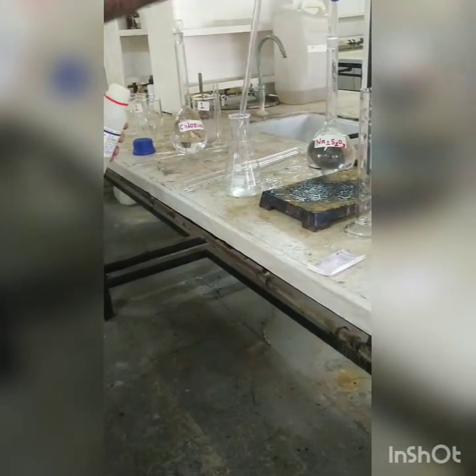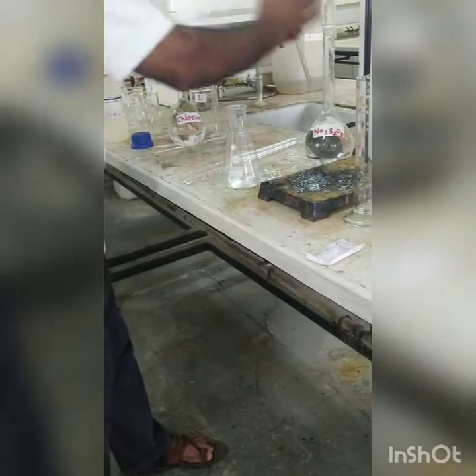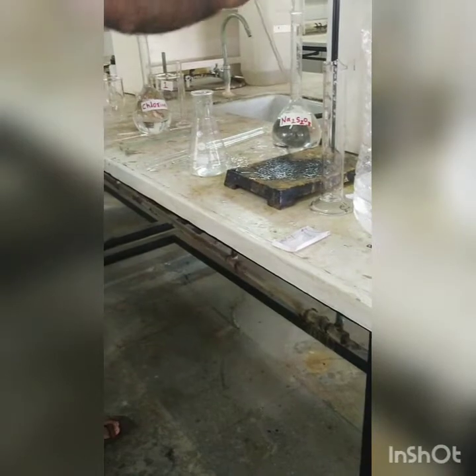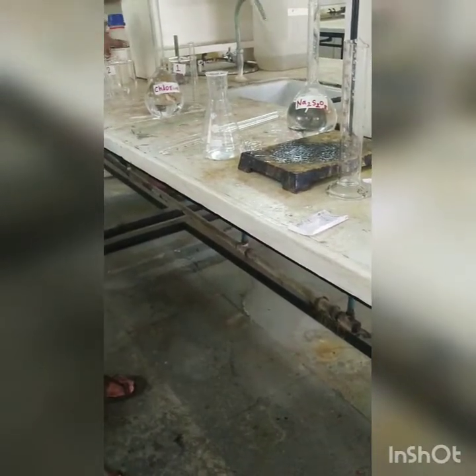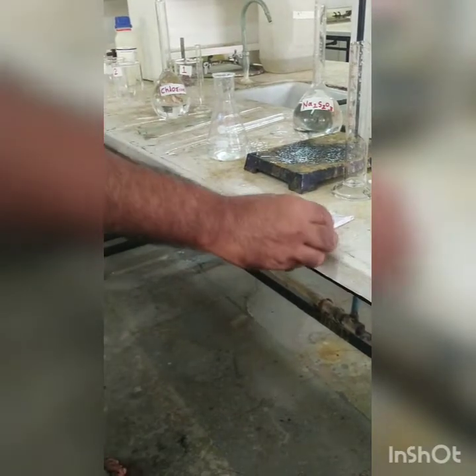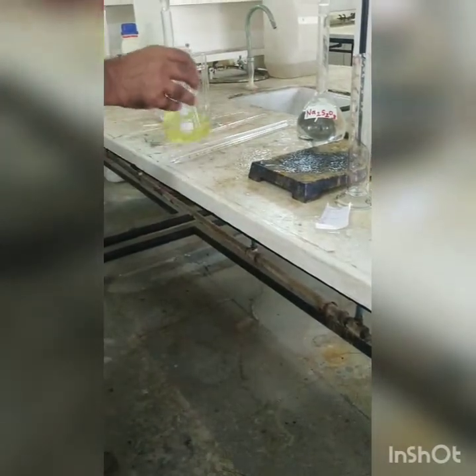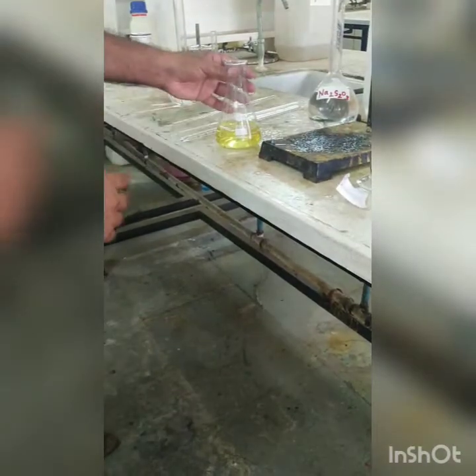So we are adding 2 ml of concentrated acetic acid. Then we are going to add 2 grams of KI crystals, potassium iodide crystals. Then add 1 to 2 ml of starch indicator.